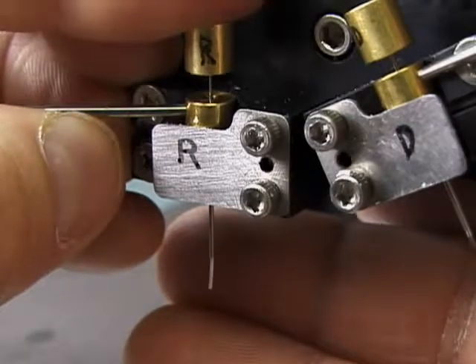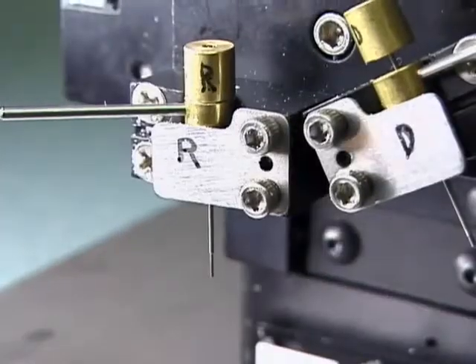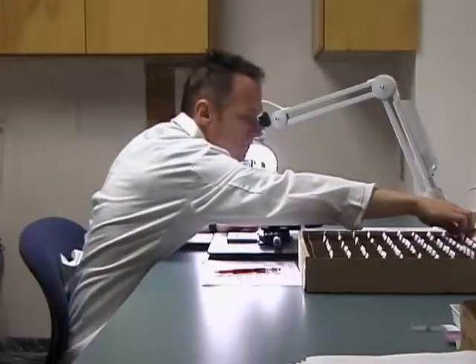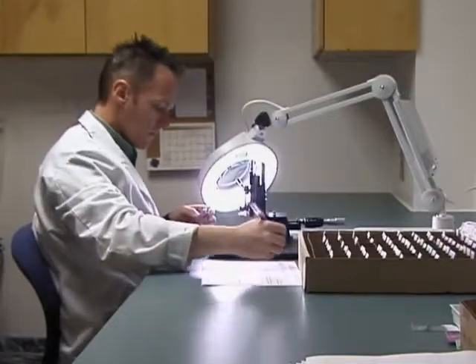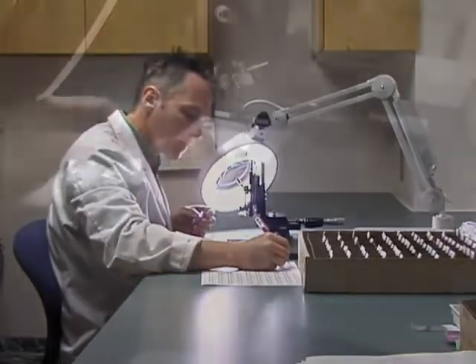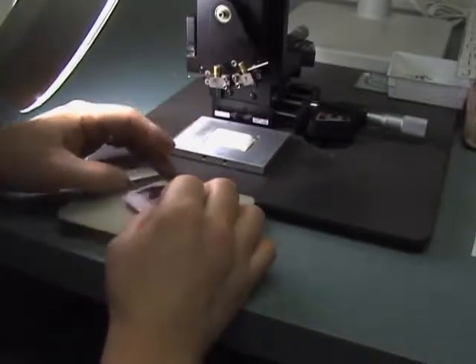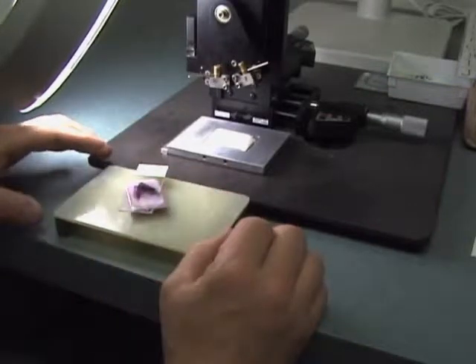Remember to eject the paraffin or you'll start to get a buildup of paraffin in the recipient needle. Don't forget to mark the grid paper each time a block is pulled. Match the block and slide so you punch the proper location in the donor block.